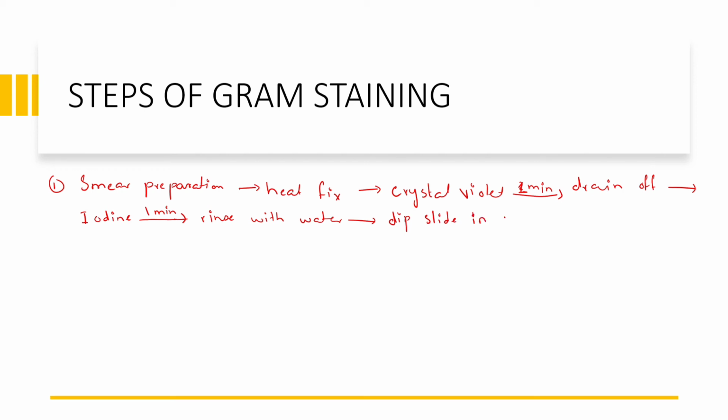Leave it for 1 minute. Then rinse it with flowing water. Then the next step is to dip the slide in alcohol for about 2 to 3 times, not longer, just for a second. Then rinse the slide with water.